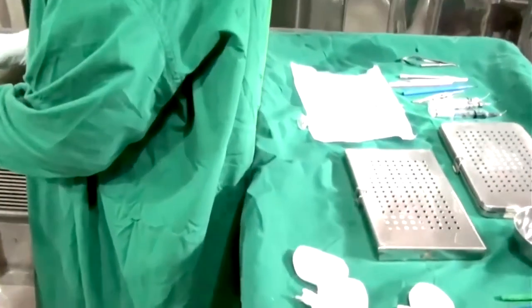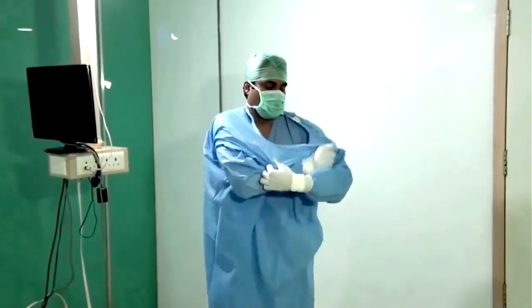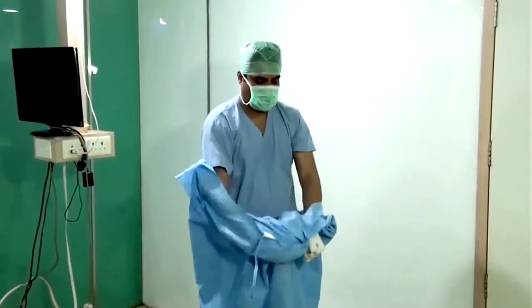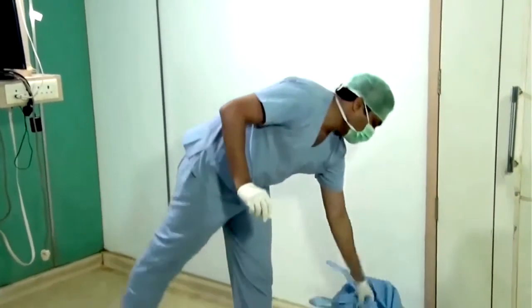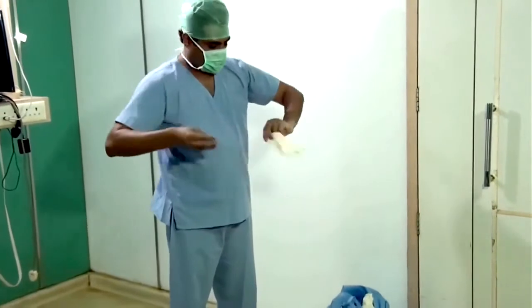And then look at that, when you have two tables, the back touching the second table. And finally, this is the proper way of removing your gown. The gown has to be removed first, followed by the glove. We normally remove our glove first and then the gown. This is the proper way of removing the gown.